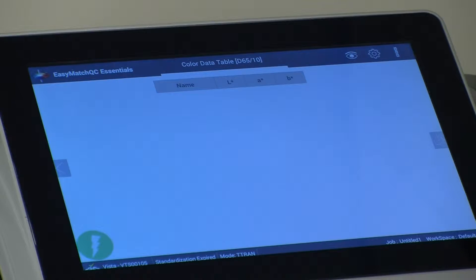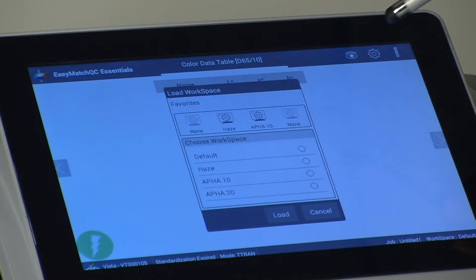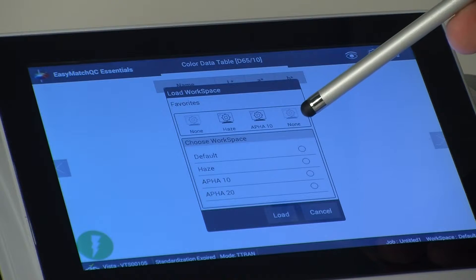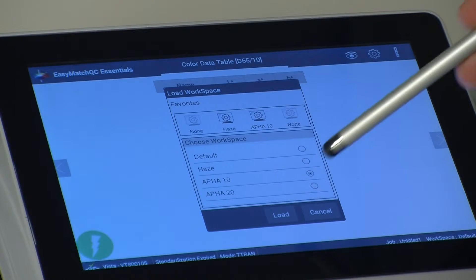From the Workspace Settings icon, select Load Workspace, and then select the workspace corresponding to the Path Cell length that you will be using. In this case, we will use 10, and then select Load.